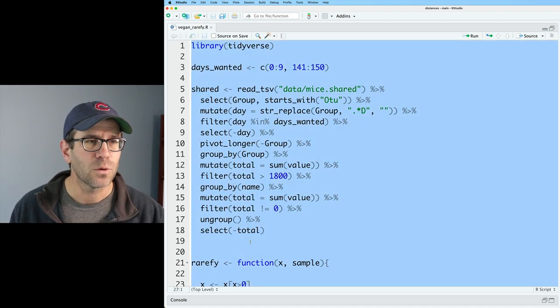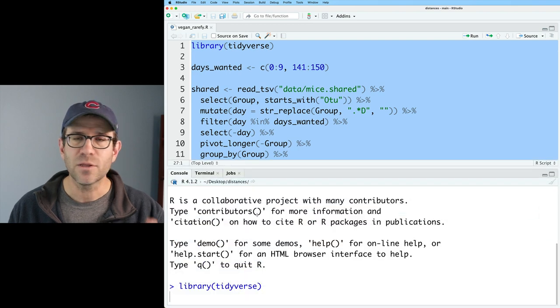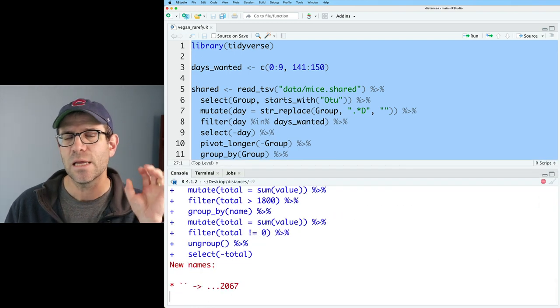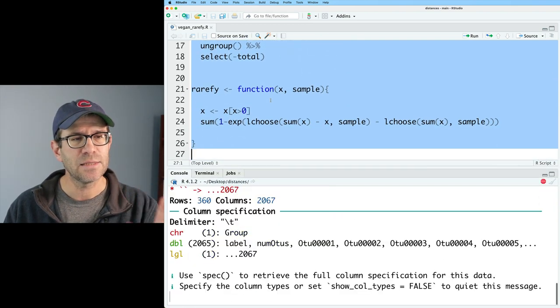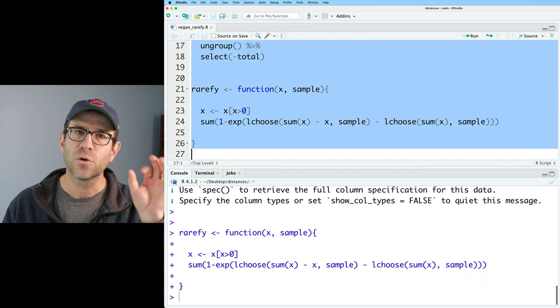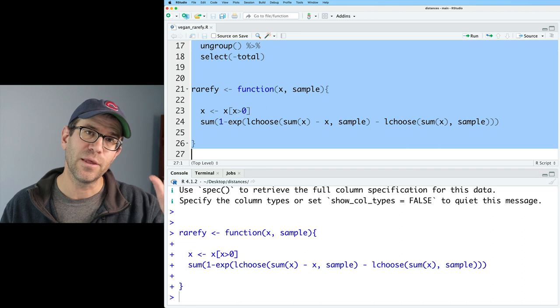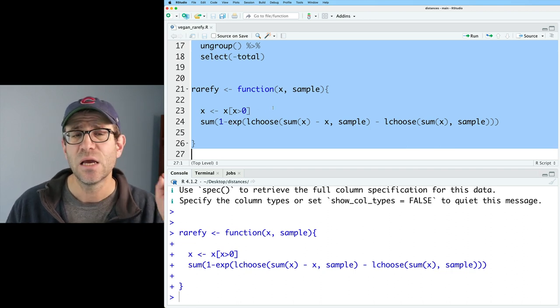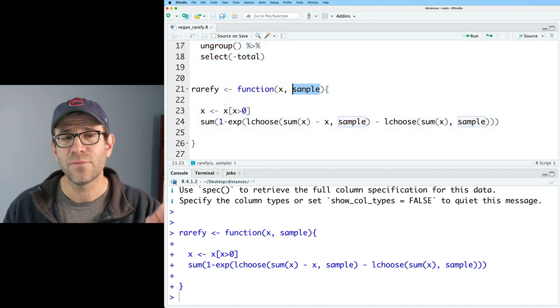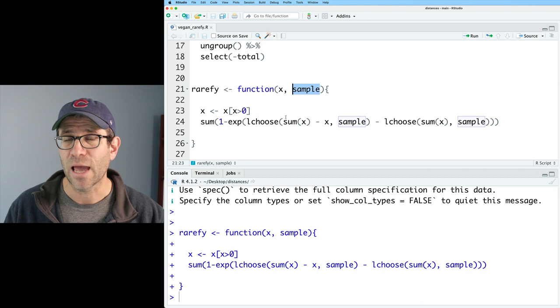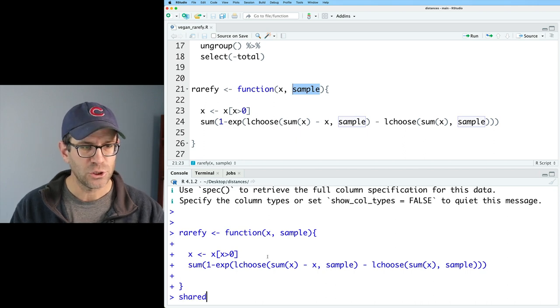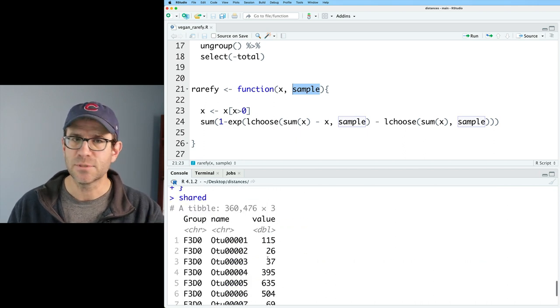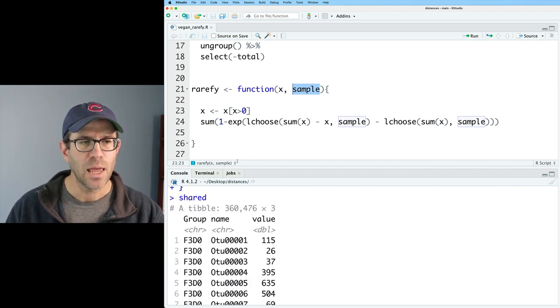I will go ahead and load everything here. I also have a function that is in this script for calculating the number of OTUs or taxa that you would expect to see for a given level of sampling effort. Looking at shared, we again see those three columns that I mentioned.